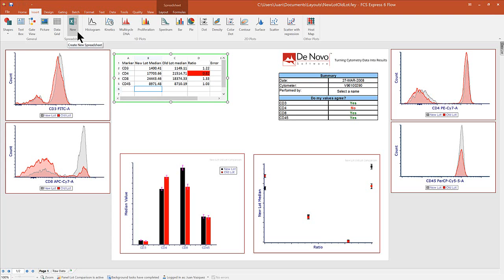So you don't have to take your data, you don't have to export it out, and you don't have to go through the time and the trouble and the effort to actually go through the process of analyzing your data, exporting your data, then analyzing it in Excel or whatever software you're using to calculate statistics. You can do this all here in the software.